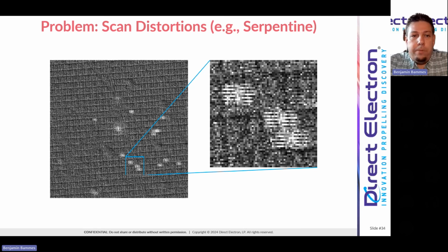Once you do this, if you're operating fast enough with a fast enough dwell time, so if you're either doing conventional 2D STEM, as the examples that I'm showing you here are, or if you're going very fast with a Celeritas XS camera, for instance, with about 11 microseconds dwell time, you end up seeing some artifacts in the images with different scan patterns. And this is because of the behavior of the electromagnetic scan coils in the microscope. This is simply based on the physics of how scan coils work.